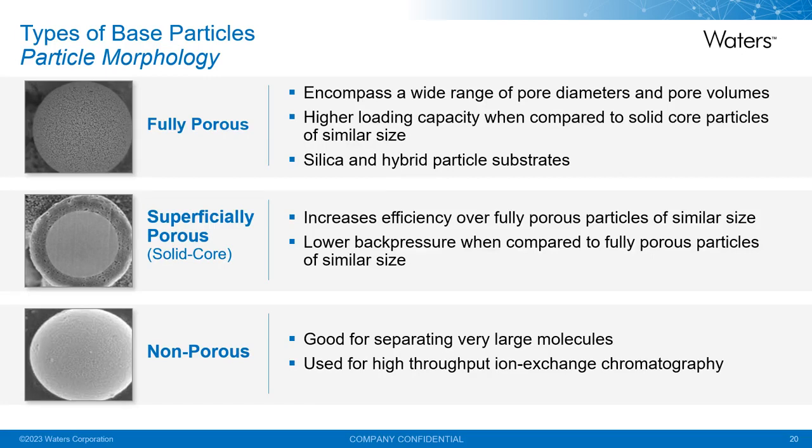Superficially porous particles have increased efficiency over fully porous particles of similar size, and they also have a lower back pressure when compared to fully porous particles of similar size. Non-porous particles offer a good separation for very large molecules, and they're used for high throughput ion exchange chromatography.